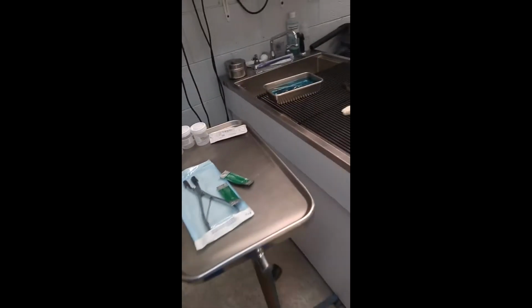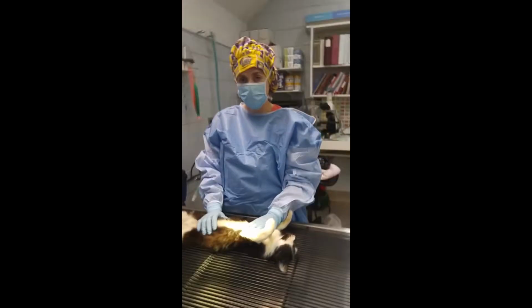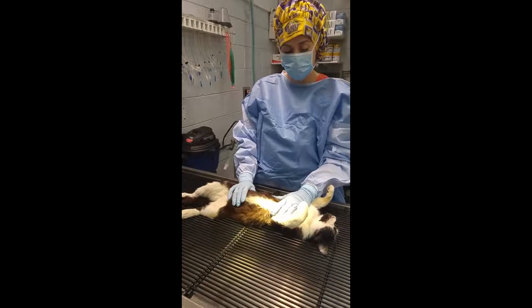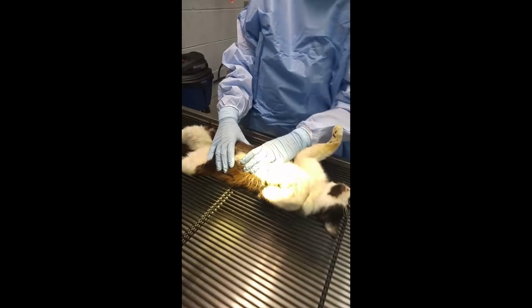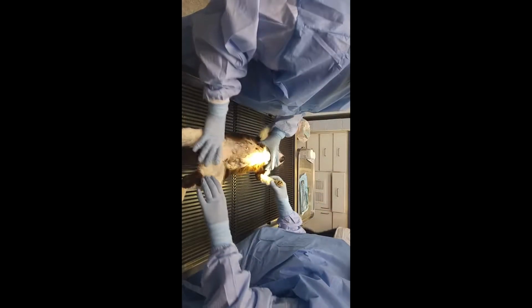As far as personal protection, I have on a cap, and I also have on a mask, also have a gown, and I'm also wearing gloves, as is the doctor. She is also appropriately clothed so that we can go ahead and do this necropsy and remain safe, just because we don't know much of the history on this cat. Okay, we're good.